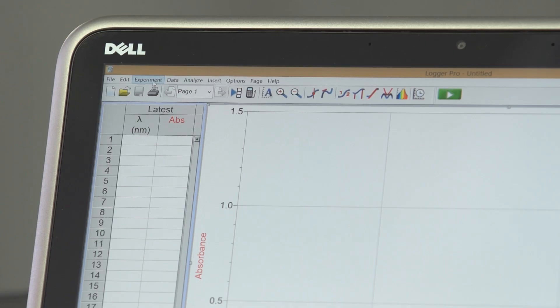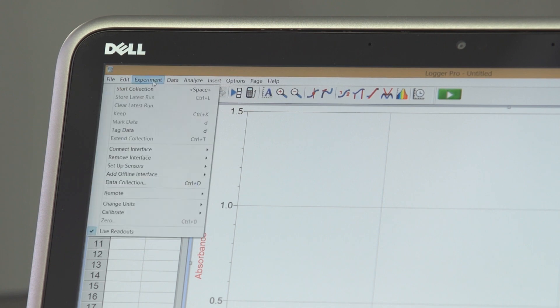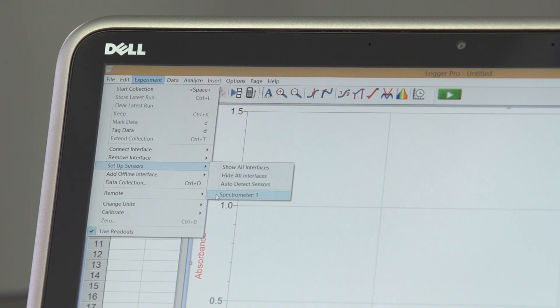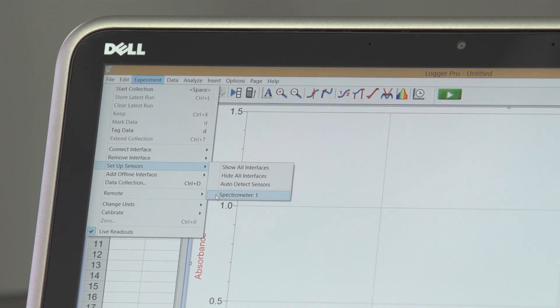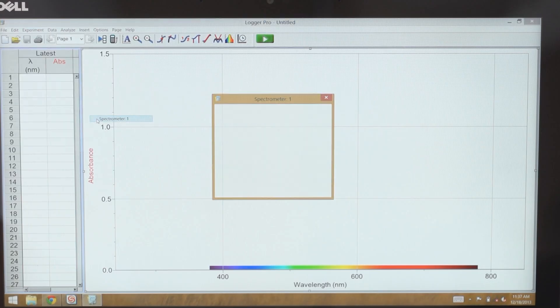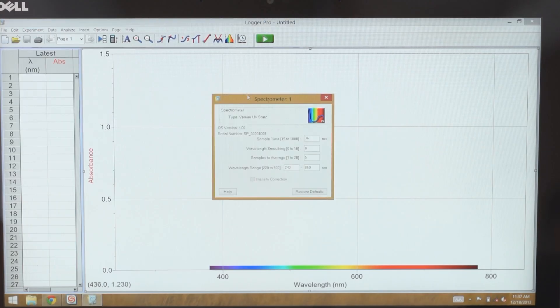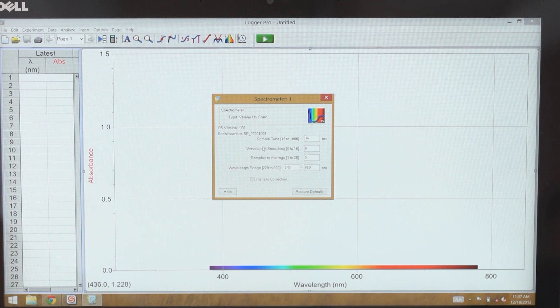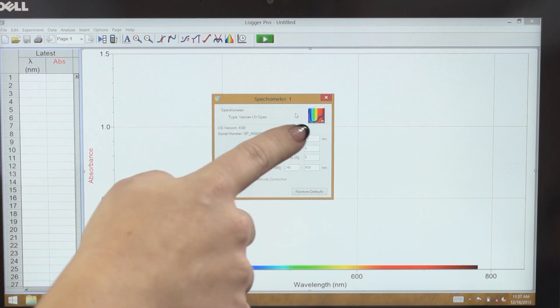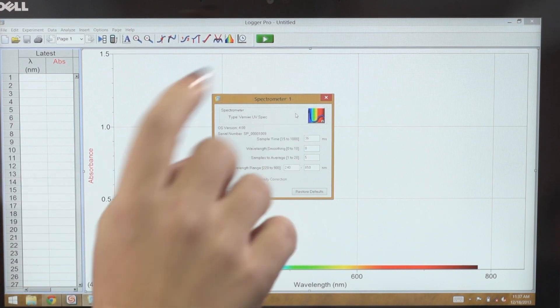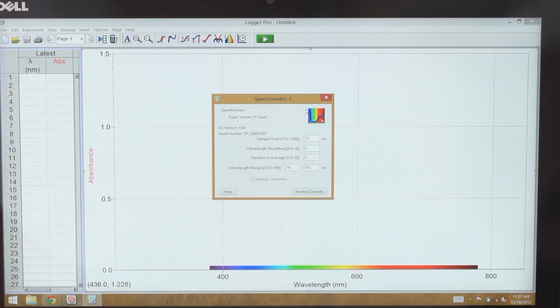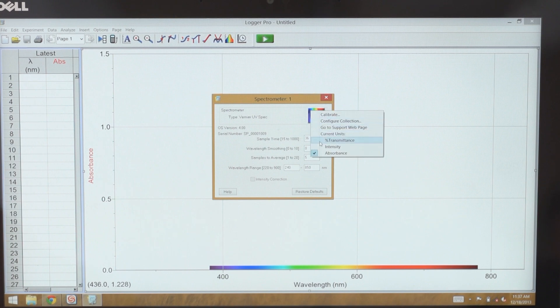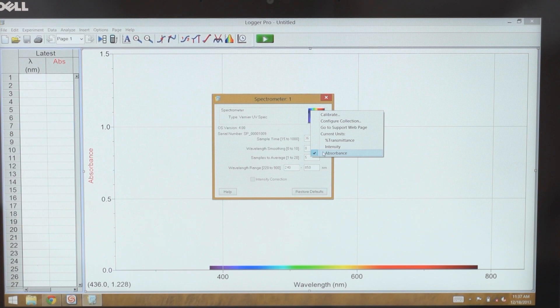To switch between the different modes, you'll want to select from the Experiment menu, Setup Sensors, Spectrometer 1. This brings up the Spectrometer dialog box. Here you'll want to select the rainbow icon to select between the different modes: percent transmission, intensity, and absorbance.